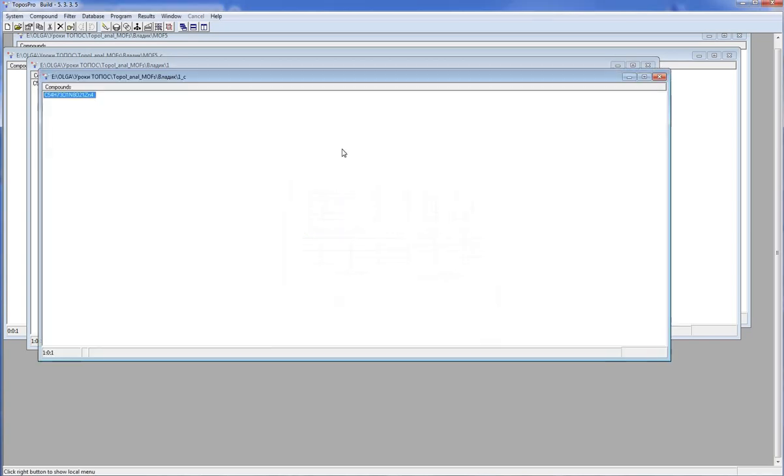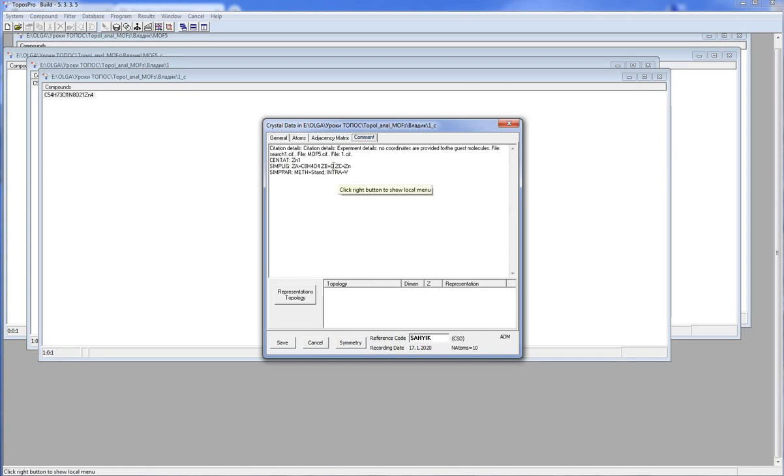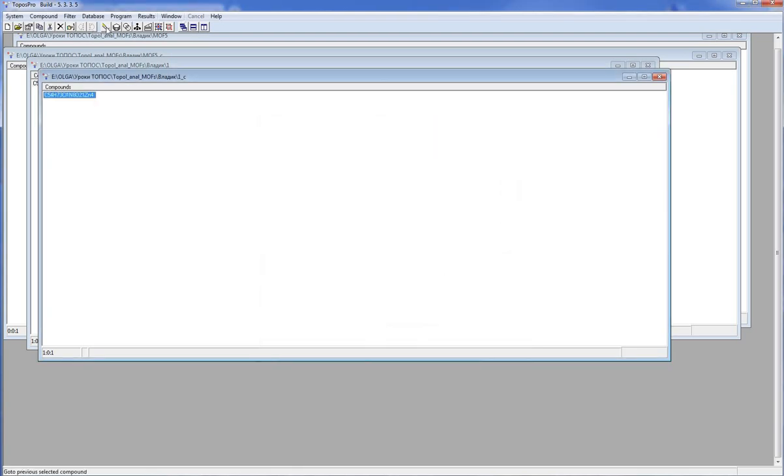Now I have a database with a simplified structure. There are three different types of simplified centers: zinc atoms, oxygen atoms, and centers of organic linkers. Let's look at the structure.